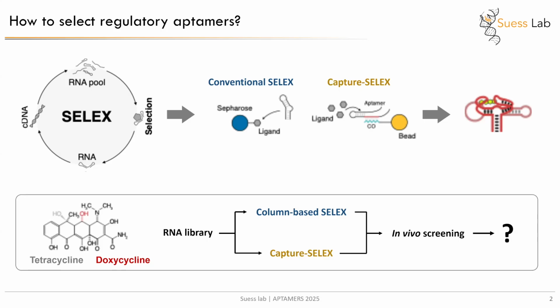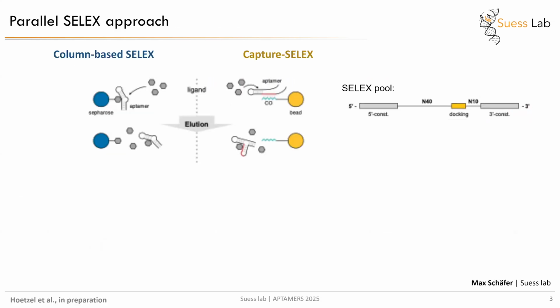And so we started with a parallel SELEX approach, where we compared column-based SELEX to Capture-SELEX, while using the Capture-SELEX pool due to the necessity of the docking sequence in here.